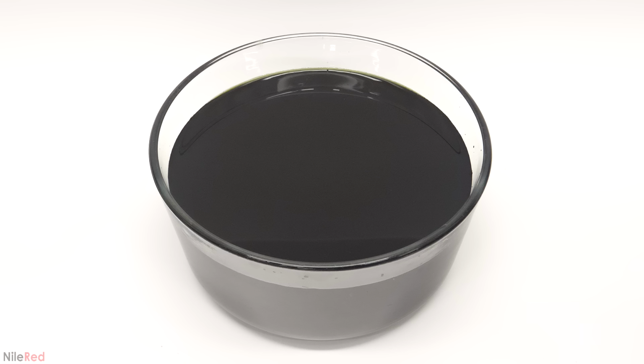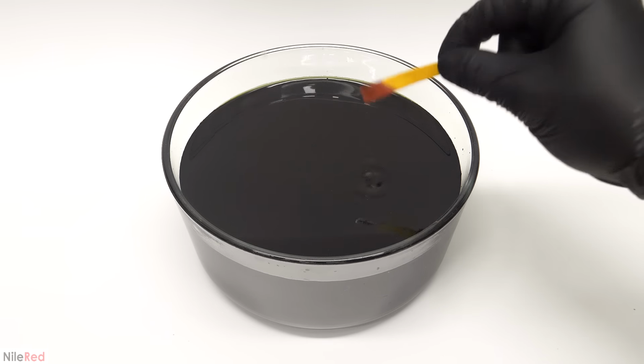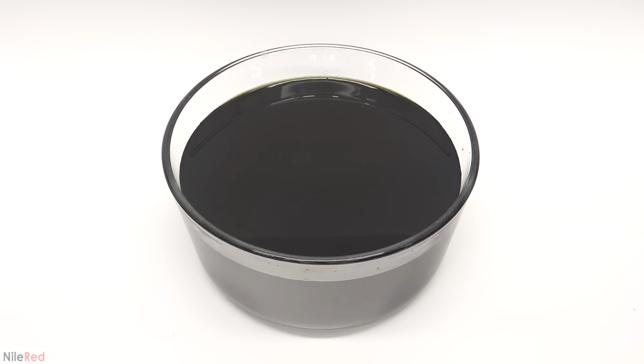Not only does all the extra water make it take up more space, it also has the risk of leaking, which can be a huge pain. So, I wanted to get rid of all the water, but it wasn't the best idea to just try and evaporate it. It was still full of acid, especially hydrochloric acid, which would release fumes and corrode everything around it.